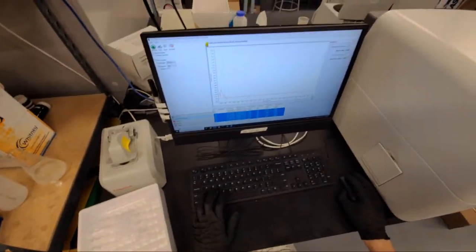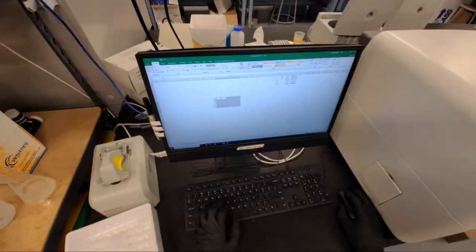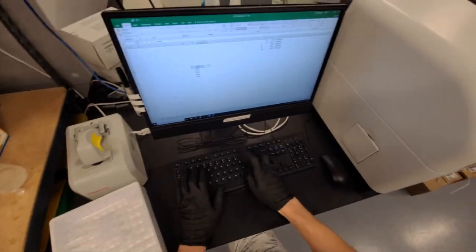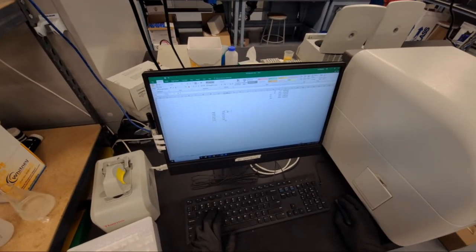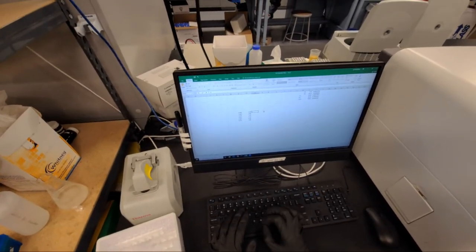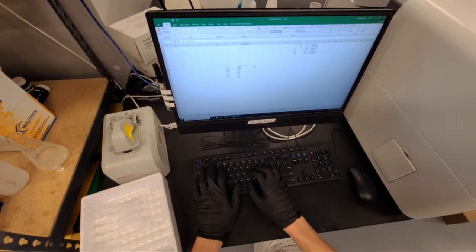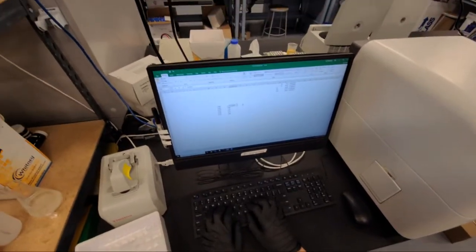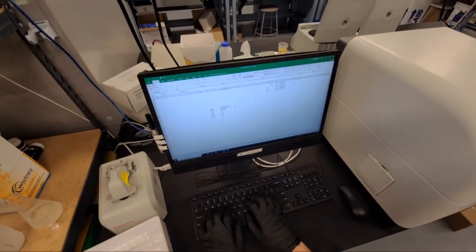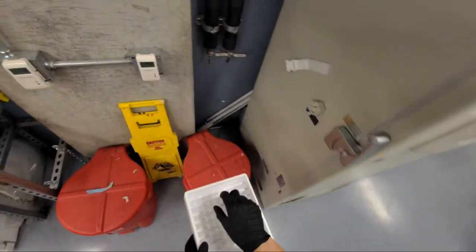I'm going to take all these readings and copy them, move them over to somebody's Excel file. And then we're going to multiply each of these readings by 20 because that's the dilution factor that we used. And then we want to inoculate each flask to an OD of 0.05. So C1V1 equals C2V2. We're going to start with the C2V2. The final volume is going to be 25,000 microliters or 25 milliliters times the final concentration, which is 0.05. And then we're going to divide that by the OD of each of these samples.